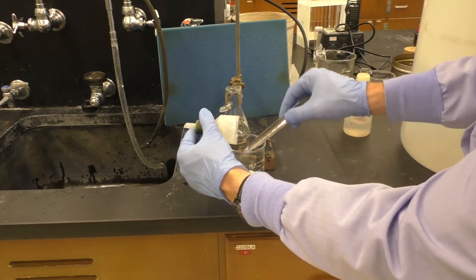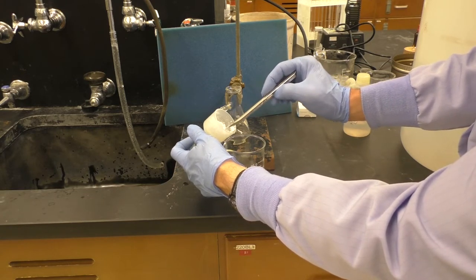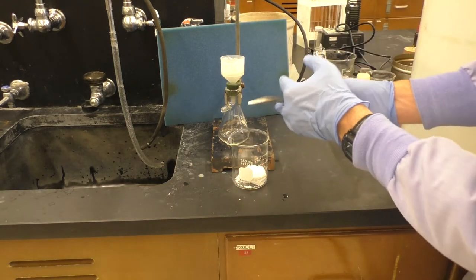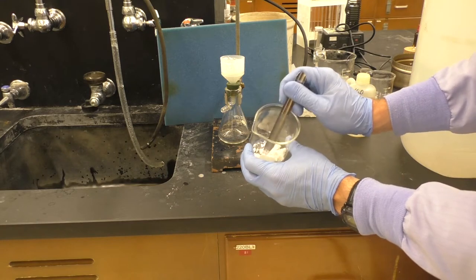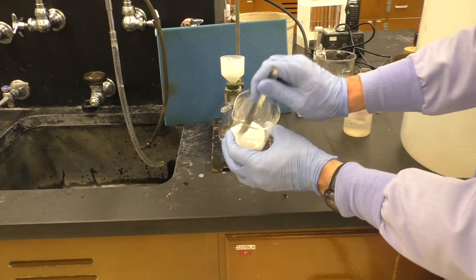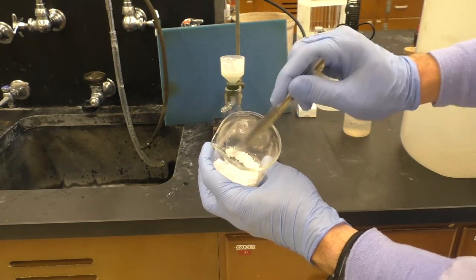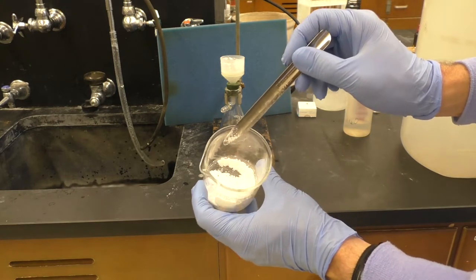So it's a large cake of material. It all came out together. I'm gonna try to leave my filter paper behind. Gonna grab that off to the side, set that back. That's now the majority of the material. I've got this in here, and you can tell it's somewhat powdery, but it's still a little wet. So I'm going to try to break it up as much as possible so that it will dry the easiest. I'm stirring that up, breaking up the large chunks. You can see it's fairly powdery, but it still feels a little bit wet. So I'm gonna go put this into the oven and then we'll let that dry for about 10 to 15 minutes before we get a final mass for the crude product.